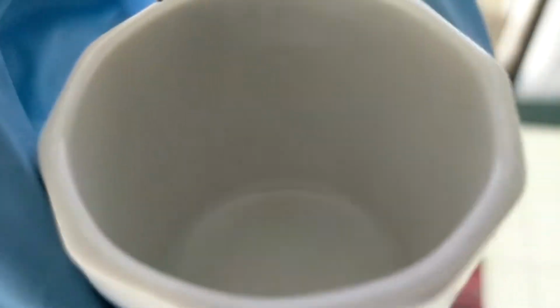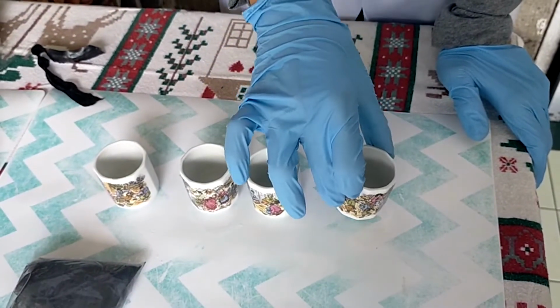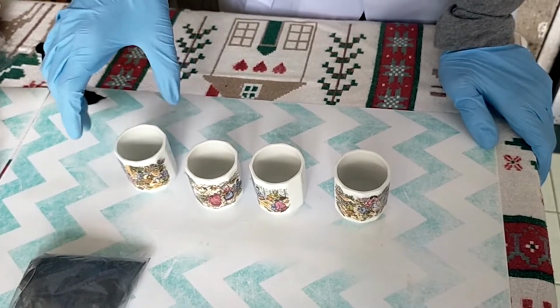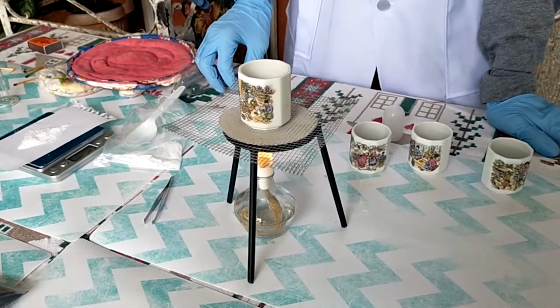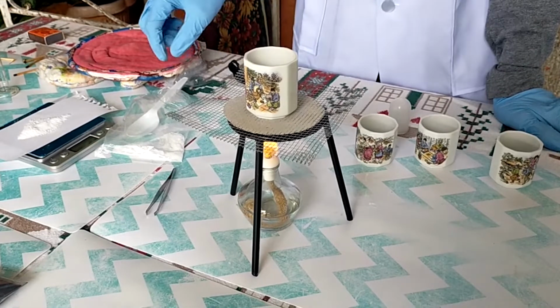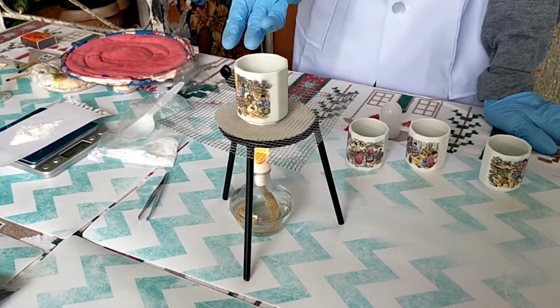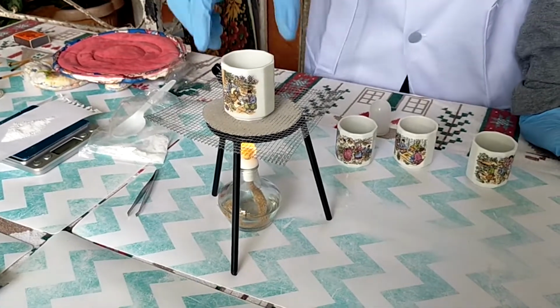Okay, so now we will subject them to heating to see if heating has any effect on the solubility of naphthalene.